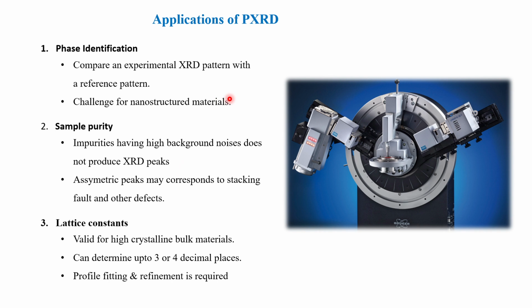These are some applications of PXRD. First is phase identification, in which we can compare the experimental XRD pattern with the reference pattern, and we can check what type of phase our crystal has. It is challenging for nanostructural materials because very broad and overlapping peaks are there.